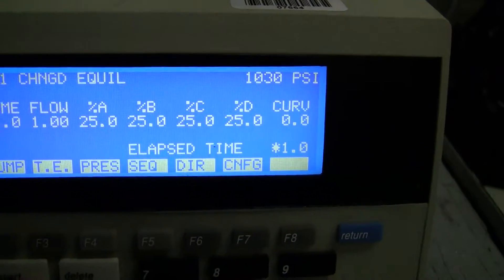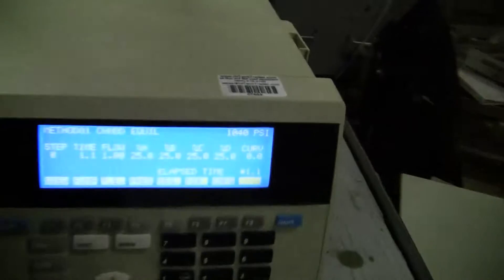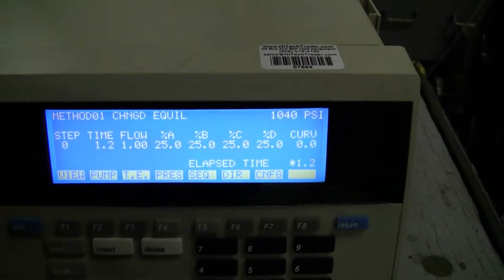We've split the flow between the four lines and it's holding pressure. We have a restriction device on the end there. That's what's building the back pressure. Flowing quite nicely.